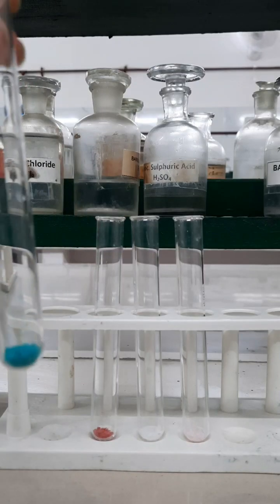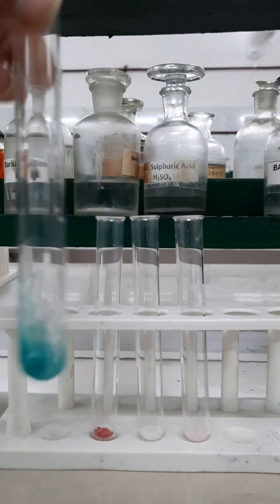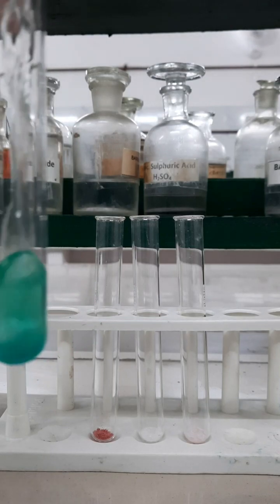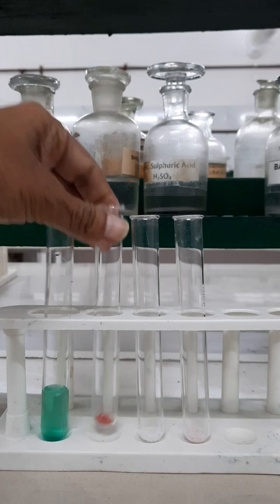Let us perform the sodium hydroxide test for the fourth group cations. Here I have taken nickel sulfate salt and I am preparing an aqueous solution of it. I am adding distilled water into it to prepare an aqueous solution of the salt.